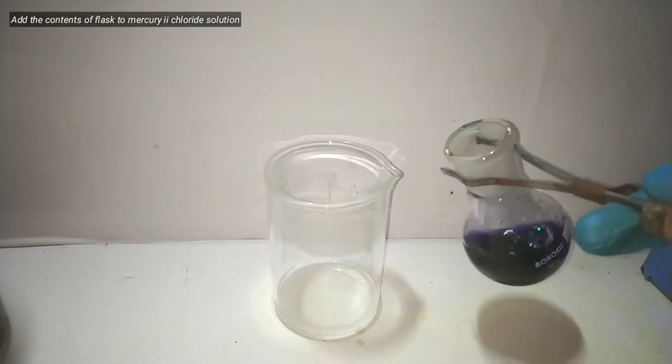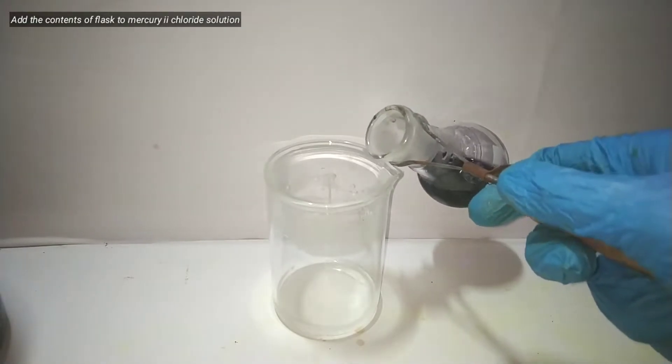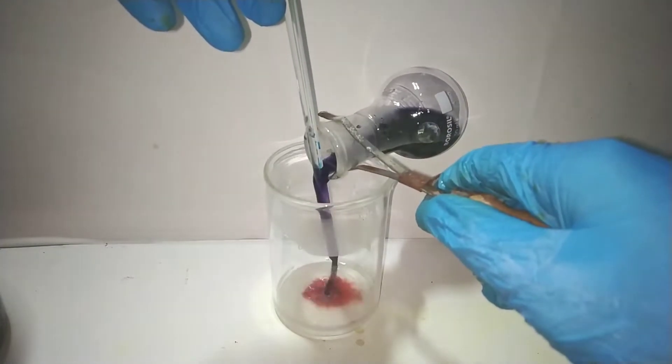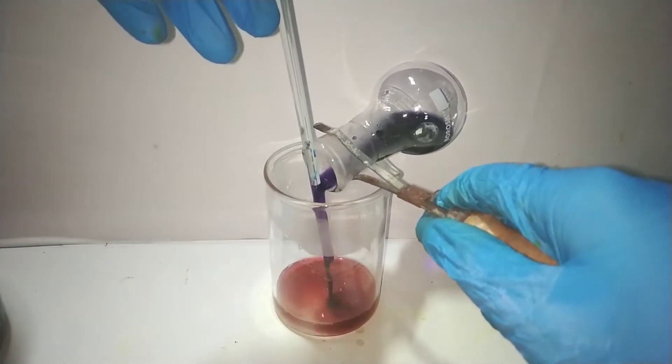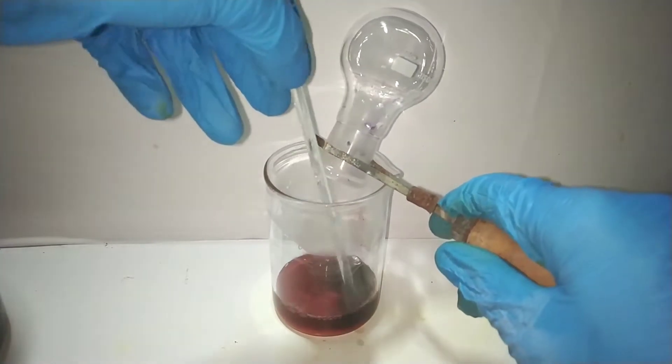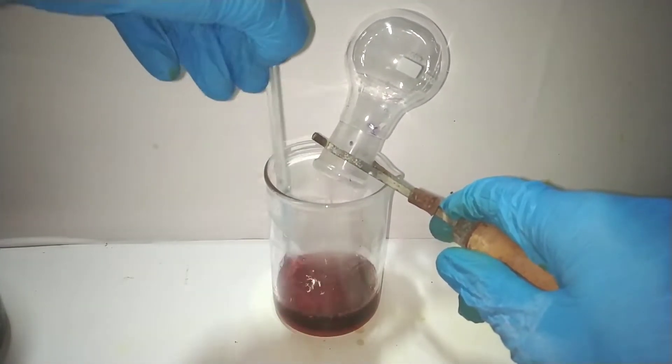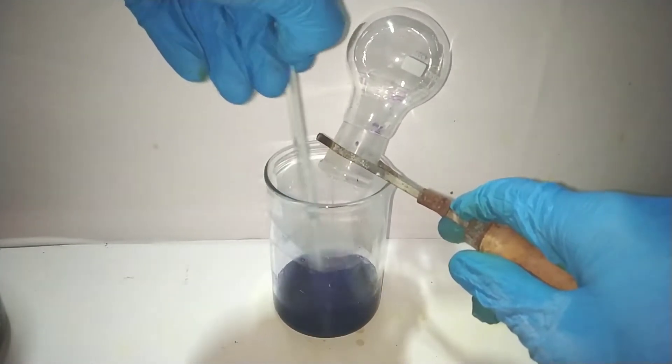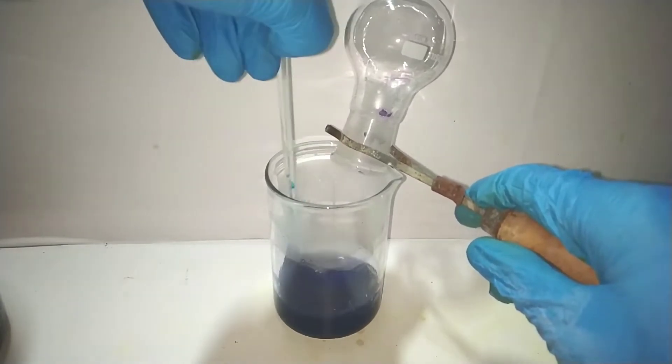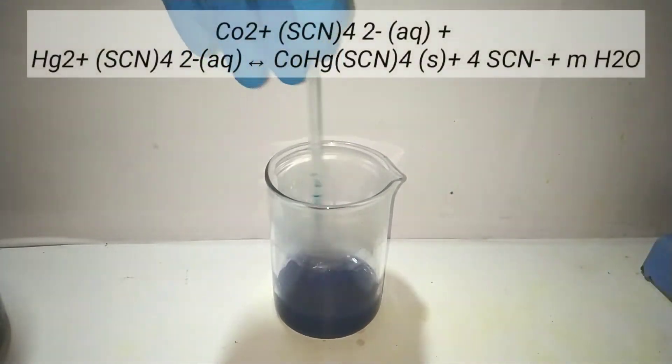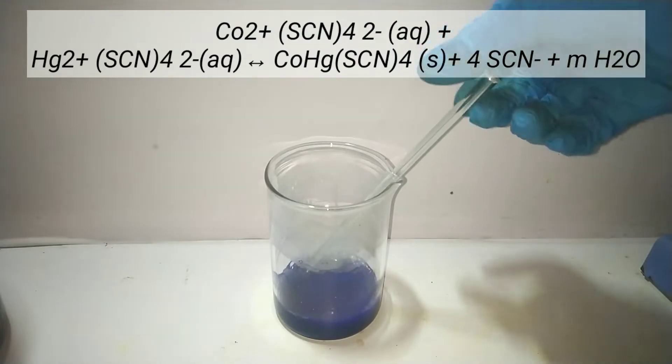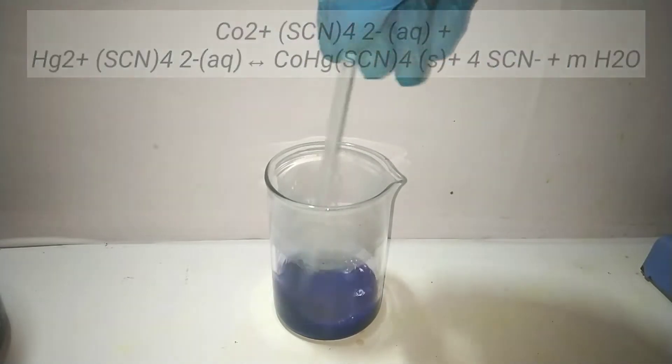Now we pour the contents of the round bottom flask to the mercury(II) chloride solution and then mix it well. On mixing the contents well we immediately see the color change and a blue precipitate has formed. This is actually the mercury(II) tetrathiocyanate of cobaltate(II) crystals precipitating out when there is equilibrium between the cobalt tetrathiocyanate and mercury tetrathiocyanate ions.